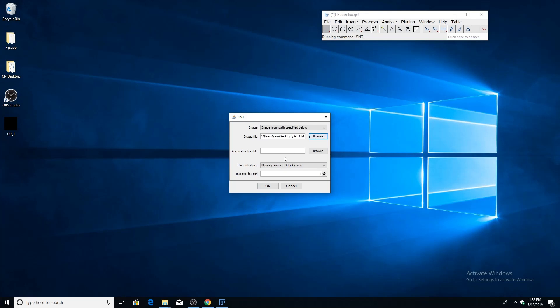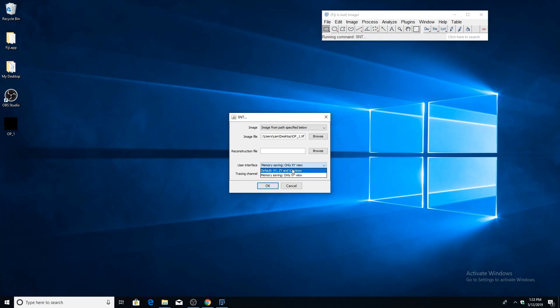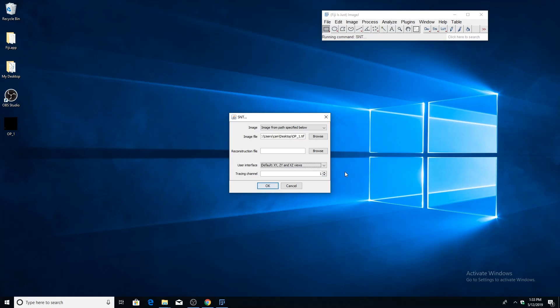The user interface parameter specifies which canvas style you want to use. There are two options: one is the three pane view, which has the XY, ZY, and XZ views. But if you want to save memory and screen space, you can choose the only XY view. We're going to go with the three pane view. If you're tracing on a multi-channel image, you could also select which channel you want to trace on. Since we're tracing on a single channel image, we'll just leave it as one. It's important to note that these parameters can be changed later on.